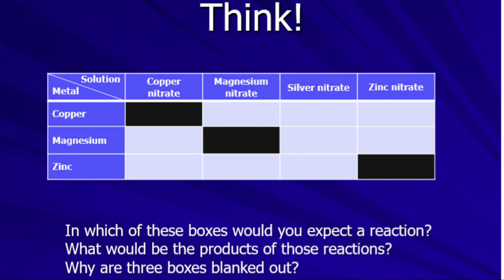Okay, so on the screen is the template for the experiment, and there are a couple of questions there. So just pause the video and have a look at these questions. Once you've answered them, restart the video and watch the rest of the experiment.